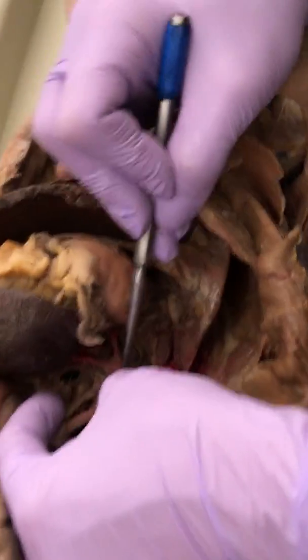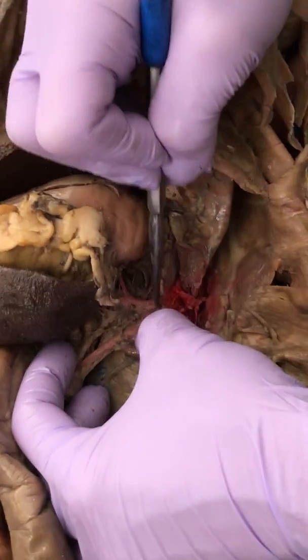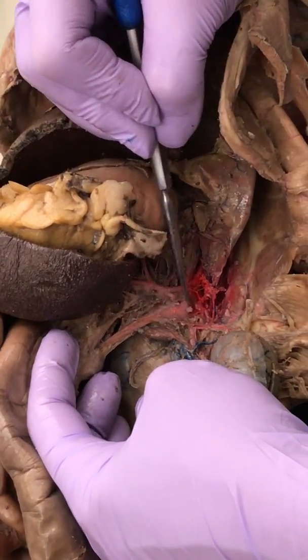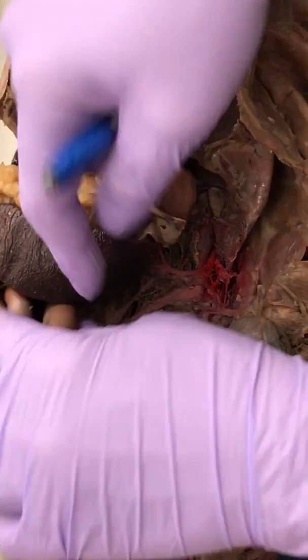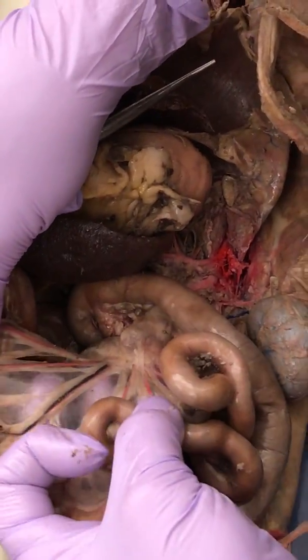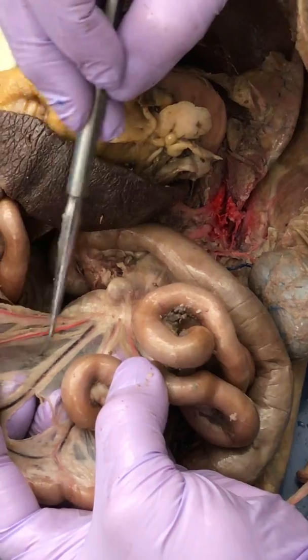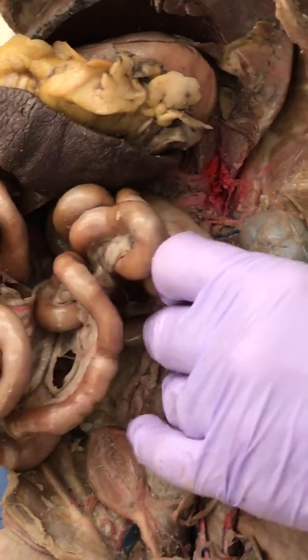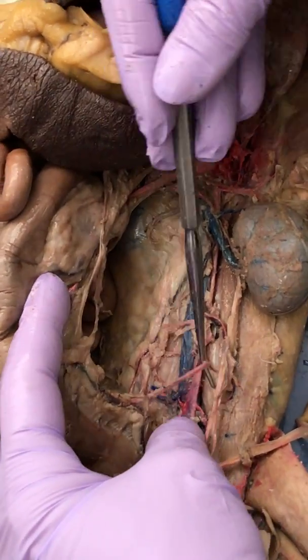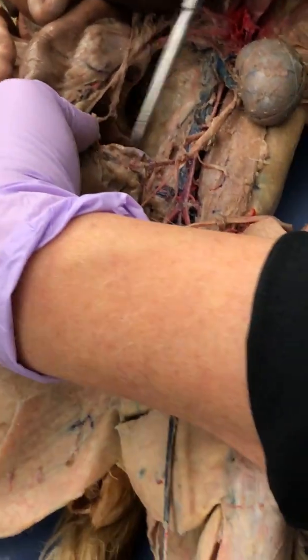Ladies, we actually could do a little more cleanup here. Because you found everything, now you know that you can break some of this connective tissue. See, look how much better that looks. What is that big artery right there? Superior mesenteric. Okay, then the superior mesenteric branches to make all of these. Those are the intestinals. What do you call this clear stuff? Mesentery. That's good. Okay, got another artery right here. That's the inferior mesenteric. That's very good.